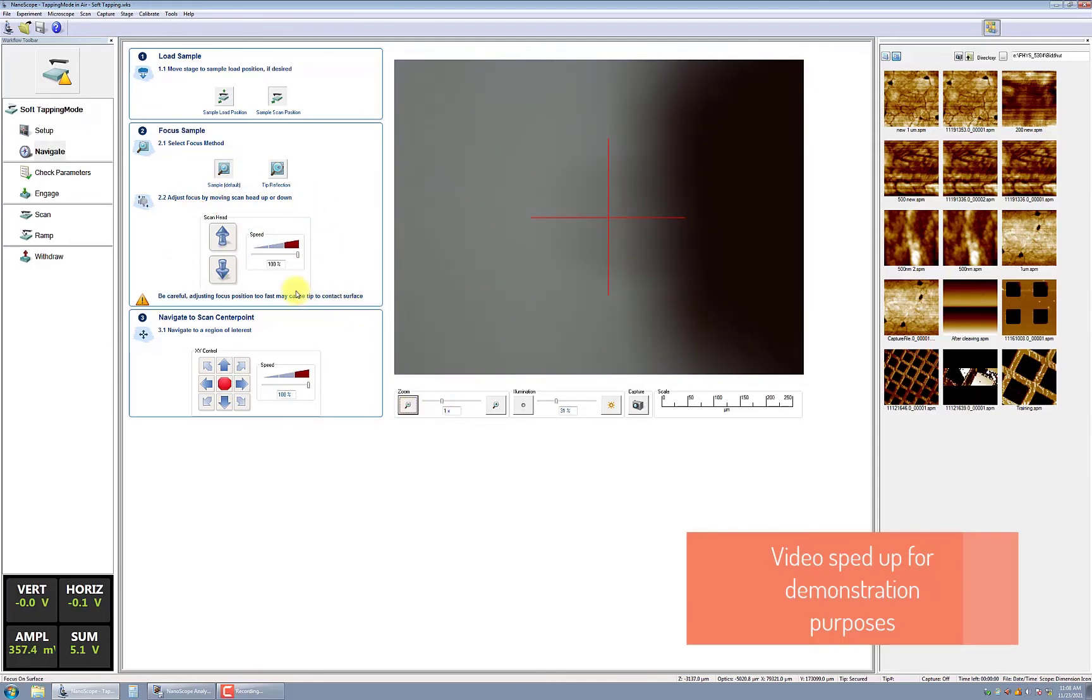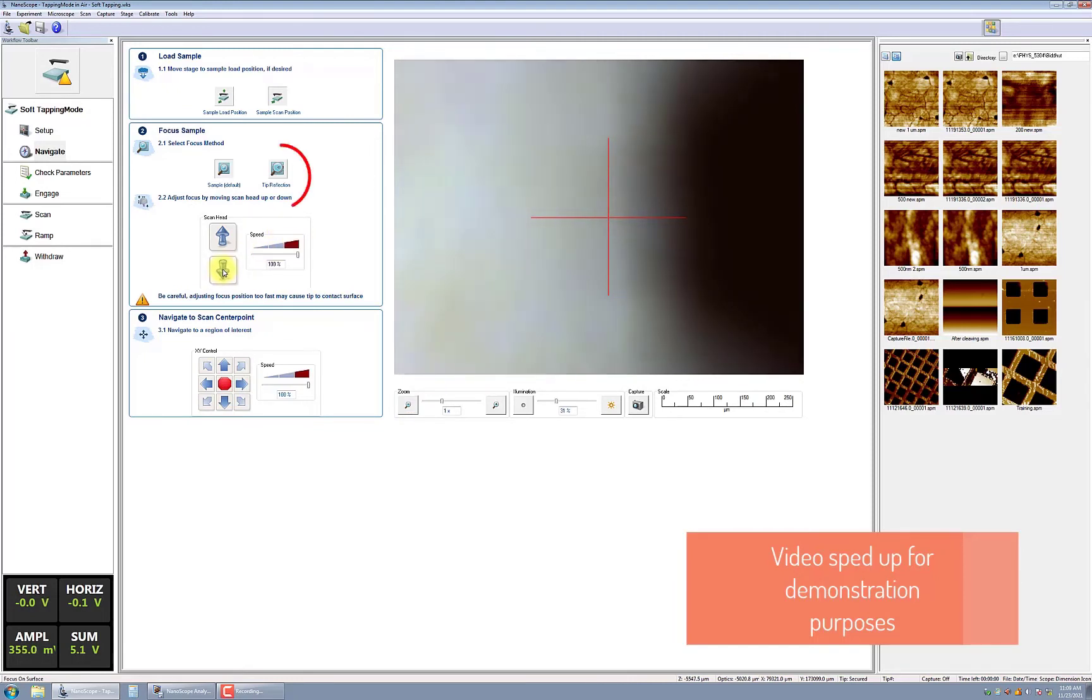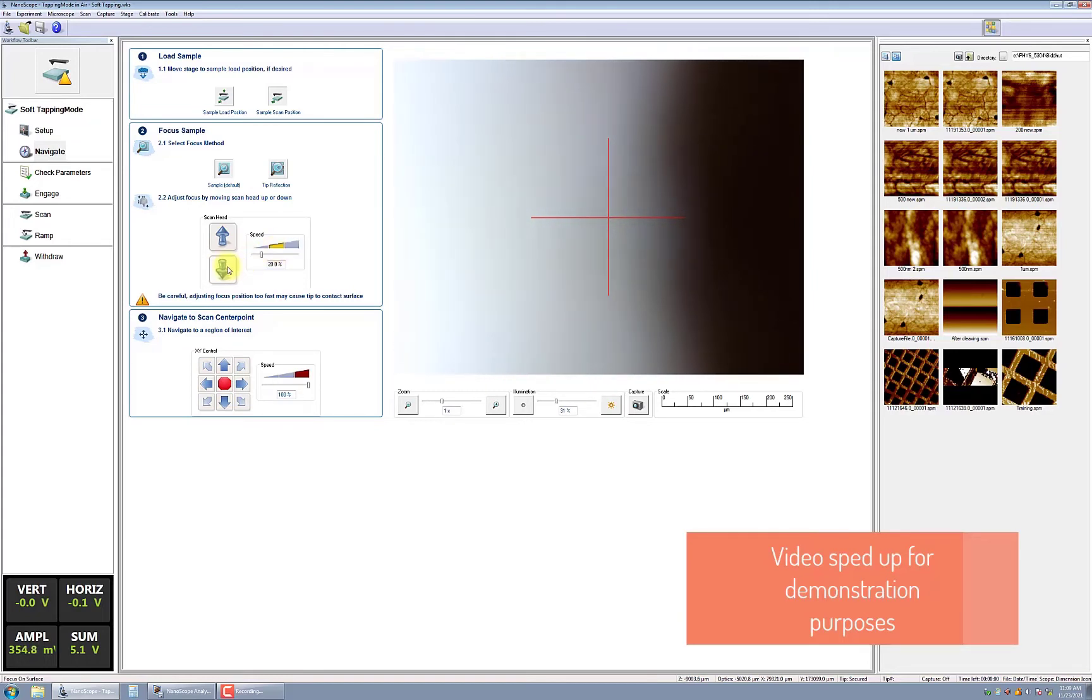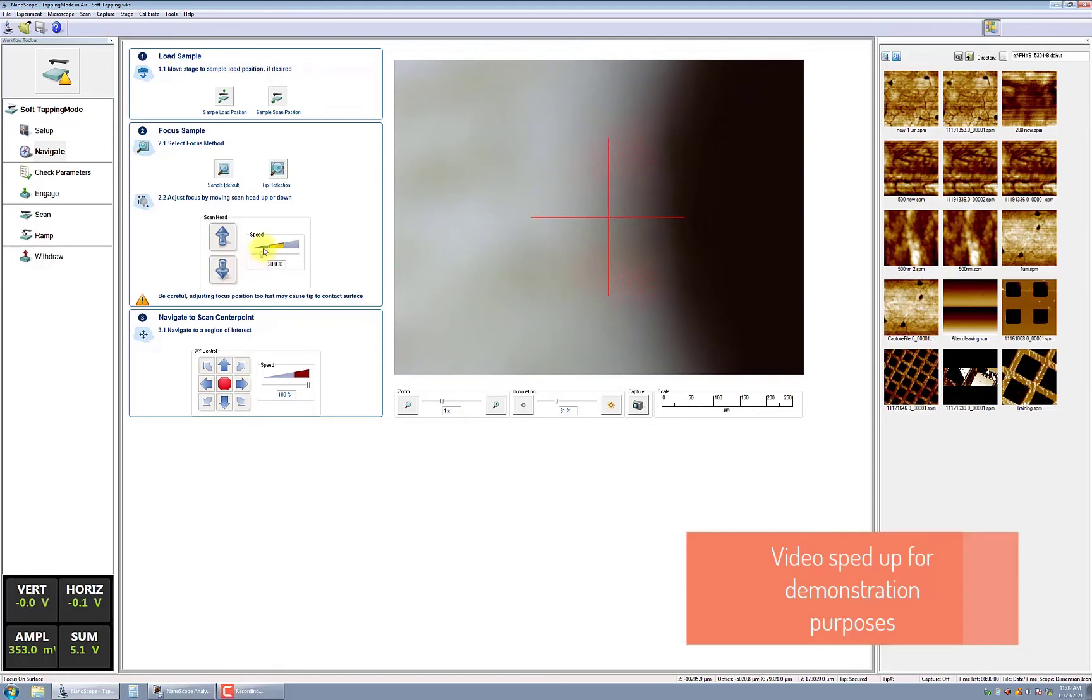If your sample is reflective with no obvious features, then it is recommended to use tip reflection. If your sample is not reflective and it also does not have discernible features, press the sample button and focus on the edge of the sample. After focusing, you can move the stage to the area of interest on your sample.